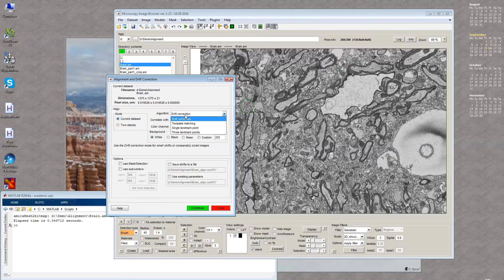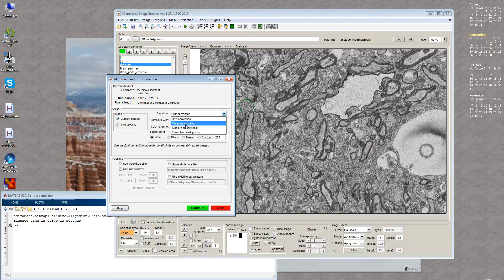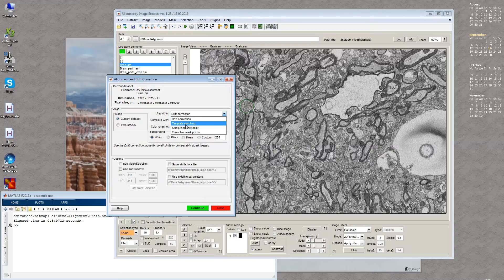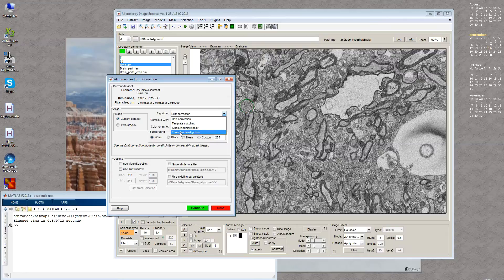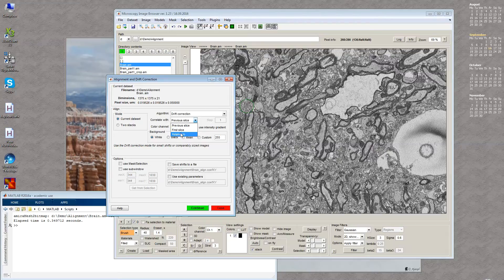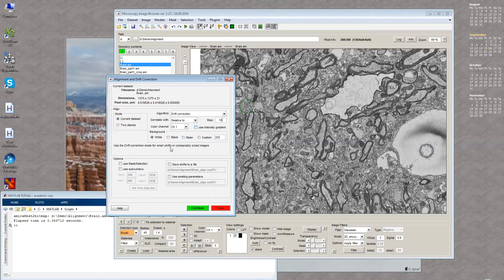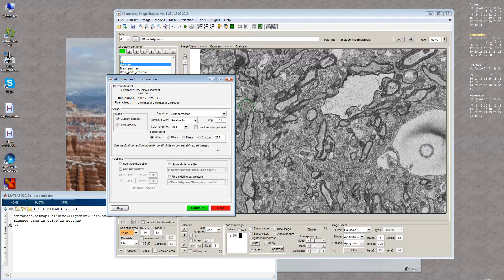The algorithm could be drift correction, which is the default and gives the best results with comparably sized images. Another algorithm is template matching for two stacks mode, and there are also two algorithms for landmark alignment. For correlation, we can use the previous slice, the first slice, or a slice relative to the one we're analyzing. For example, if there is 10 here, slice 11 will be correlated with slice 1.